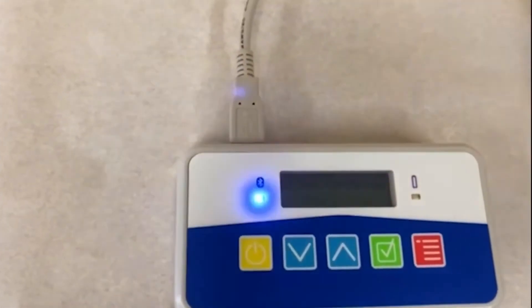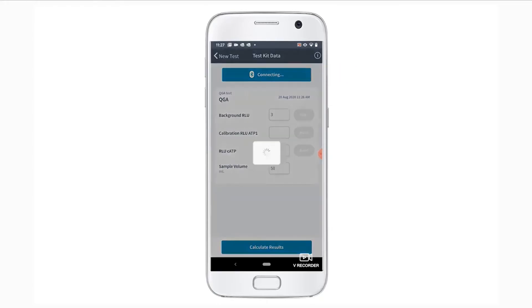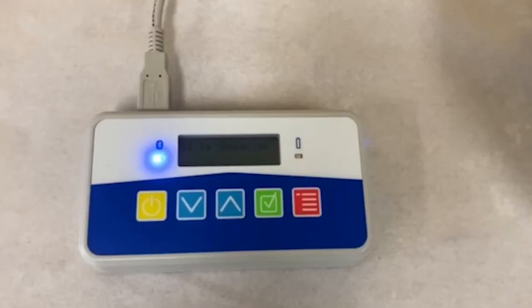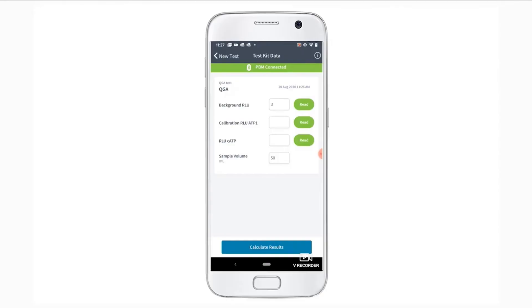Once the Bluetooth light is blinking, click the Connect to PBM button on the Test Kit data screen on your mobile device. When your mobile device successfully connects with the PBM, the PBM device's blinking blue light will stay on continuously and the Read buttons on the Test Kit data screen will turn green. You can now run a test and read data from the PBM by clicking the Read buttons.